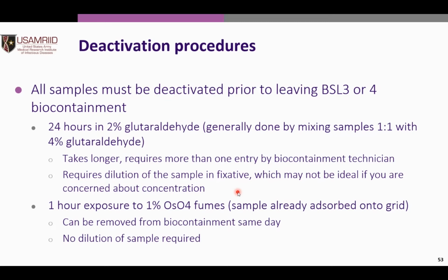For coronavirus, we are treating it as a BSL-3 agent at USAMRIID, and we have to follow all of the biocontainment procedures in order to pull it out. So again, we would be using these same ones for electron microscopy samples. I also do some diagnostic work, where we do DNA and RNA extractions and things like that. So we are using lysing agents. One that we use a lot is Trizol, if you're familiar with that. That lyses the virus and leaves the nucleic acid available for use.